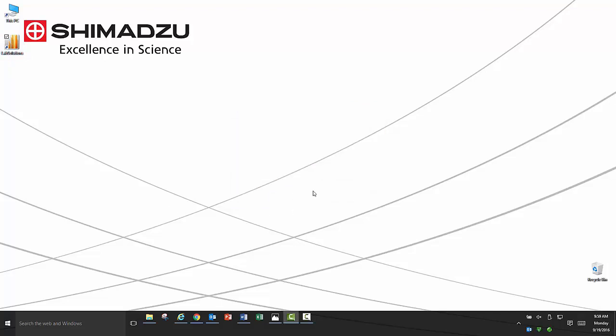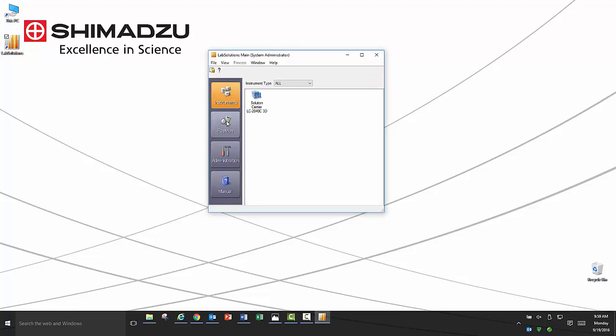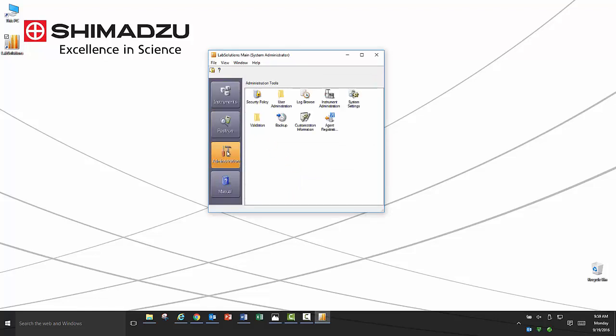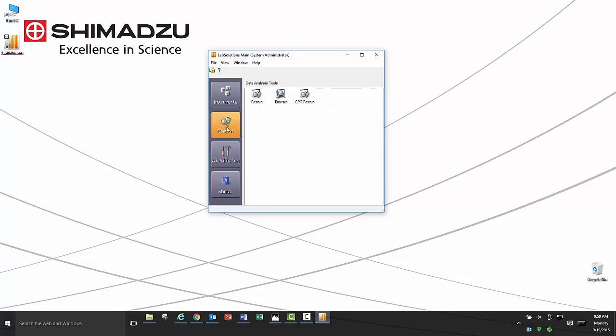On the left hand side you will see four tabs: instruments, post run, administration, and manuals. For supplemental information on data acquisition and processing theory, please see the manuals included in the software in the manuals tab.